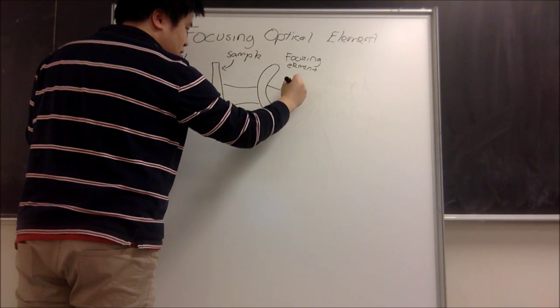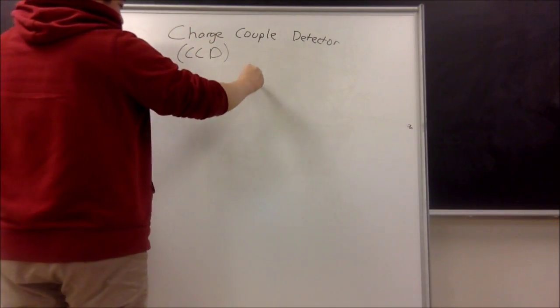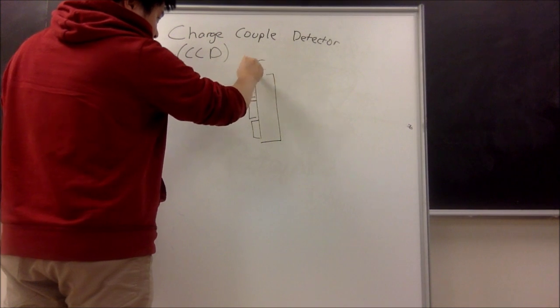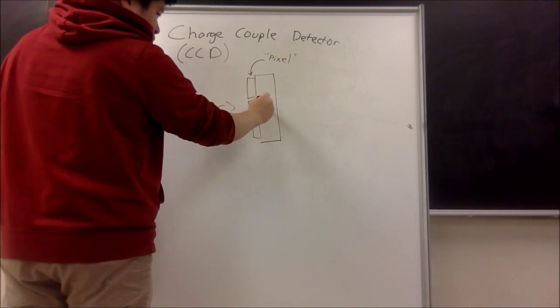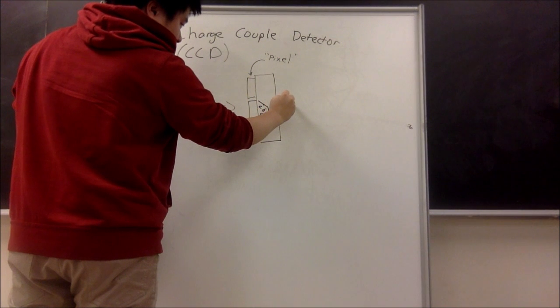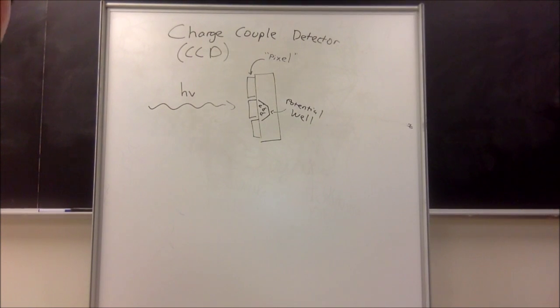In a typical X-ray microscope setup, a synchrotron, an annular particle accelerator, will produce the X-ray beam. The majority of X-ray microscopes use charge-coupled devices, CCD, detectors to record an image. CCD detectors are made up of a pixel grid of X-ray sensitive potential wells. When an X-ray strikes a pixel, its energy is transferred to the material, creating electron flow. The number of electrons is proportional to the energy of the incoming X-rays, and an image is formed from this information.